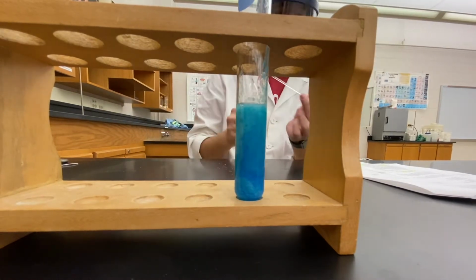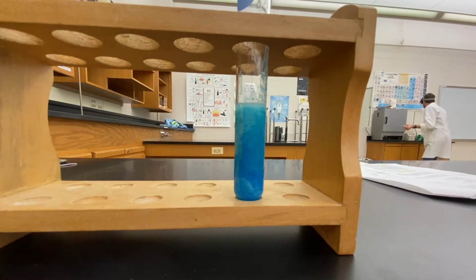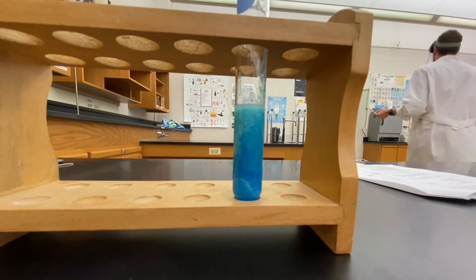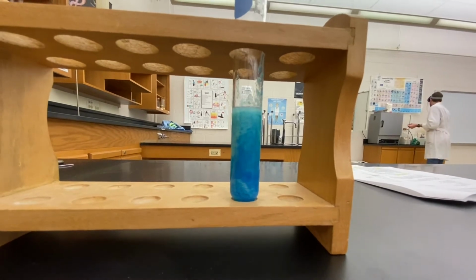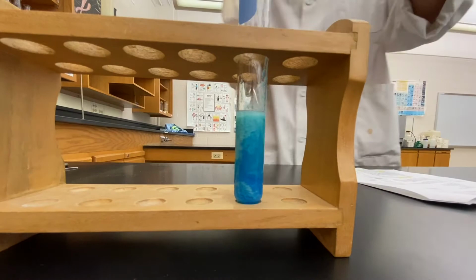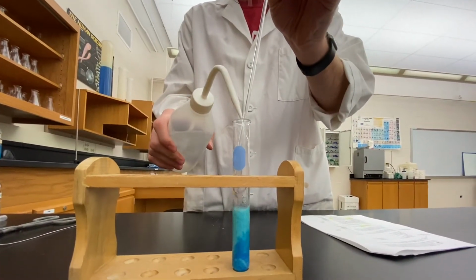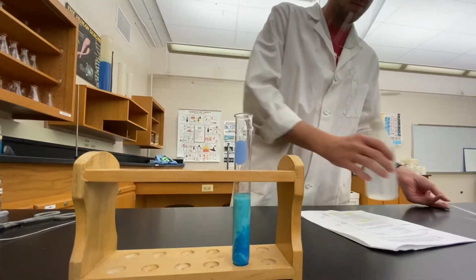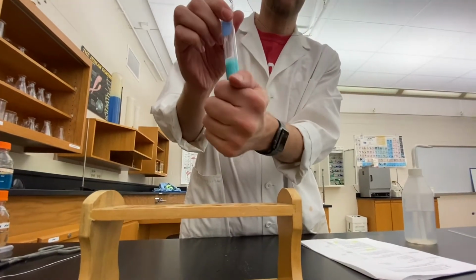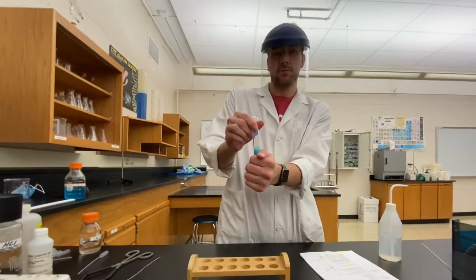Rinse the stir rod really quick with a bottle of water. You can feel the bottom of the test tube. Feels a little cool.